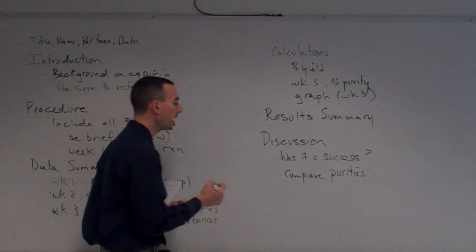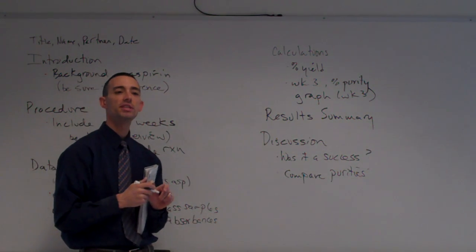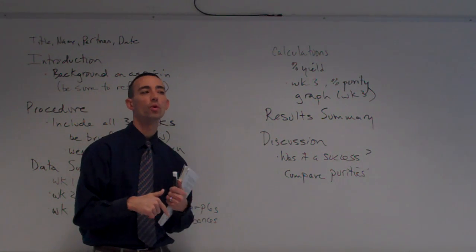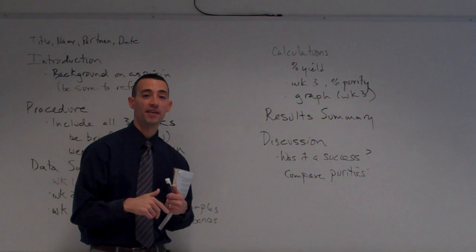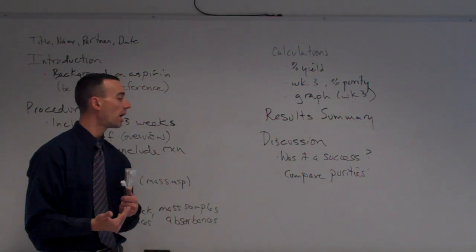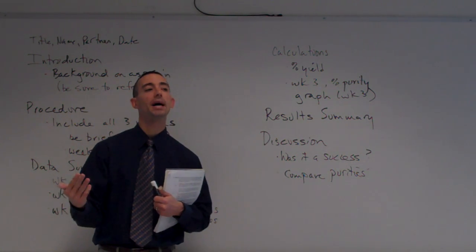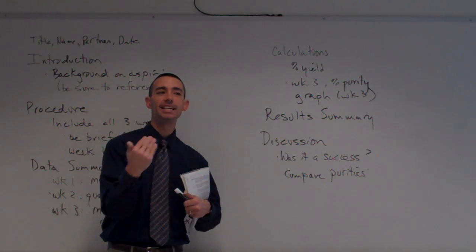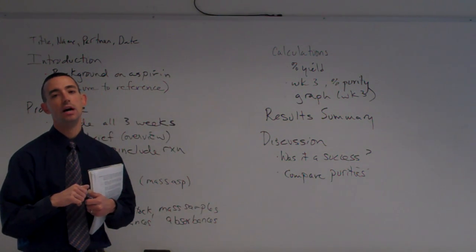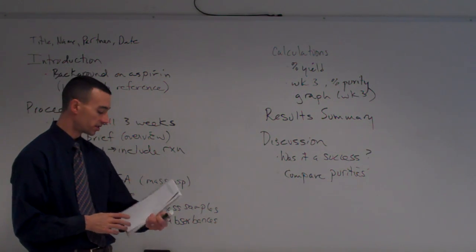Compare the new and the old aspirin. Does aspirin degrade quickly? Hopefully you kept track of how old your old aspirin sample was. If it's more than a year or 2 old, now you might understand why when they sell aspirin, there's a best if used by date on it, because it is decomposing, turning back into salicylic acid in the bottle, just sitting there on your shelf.